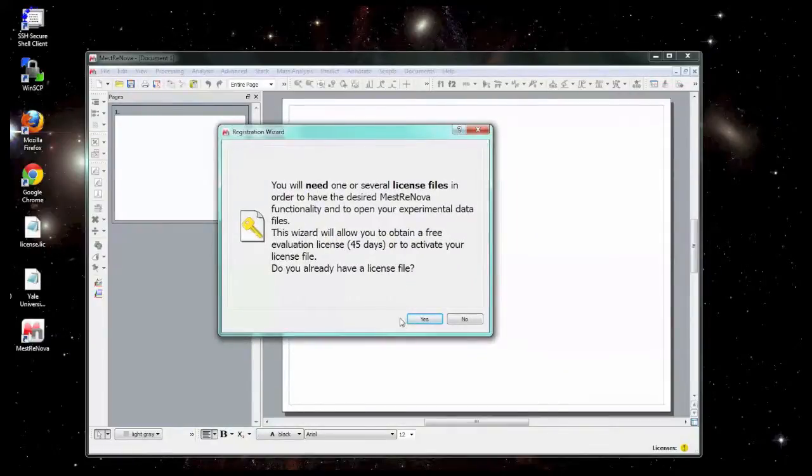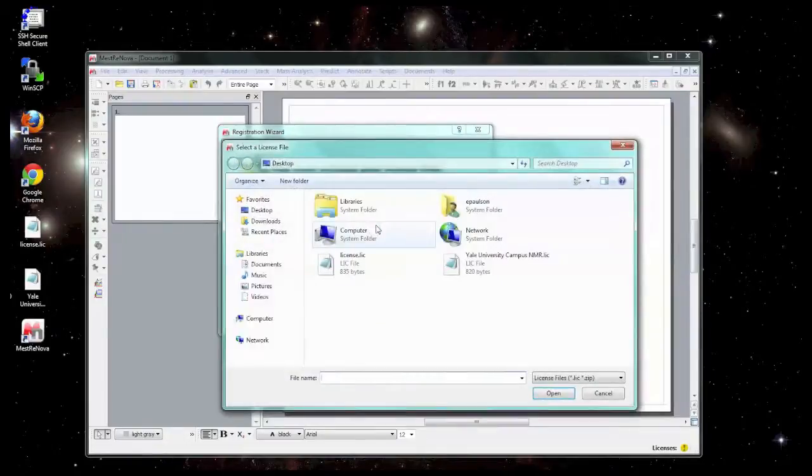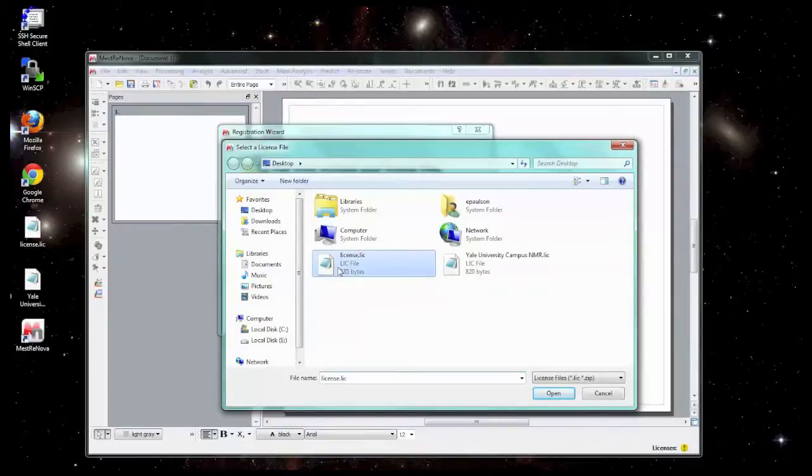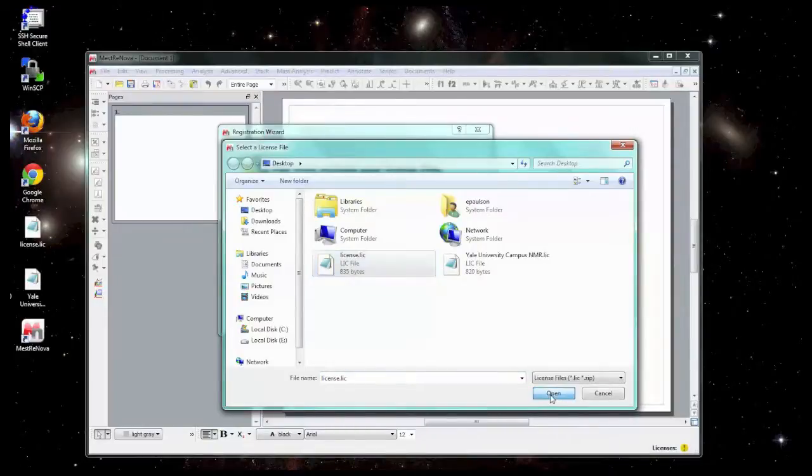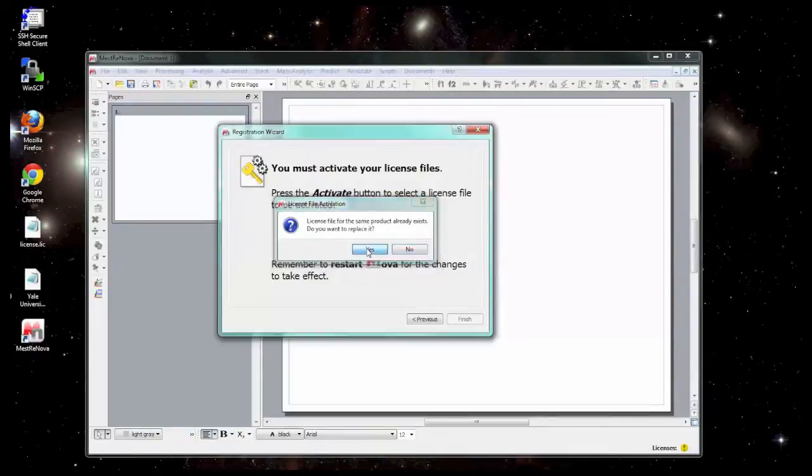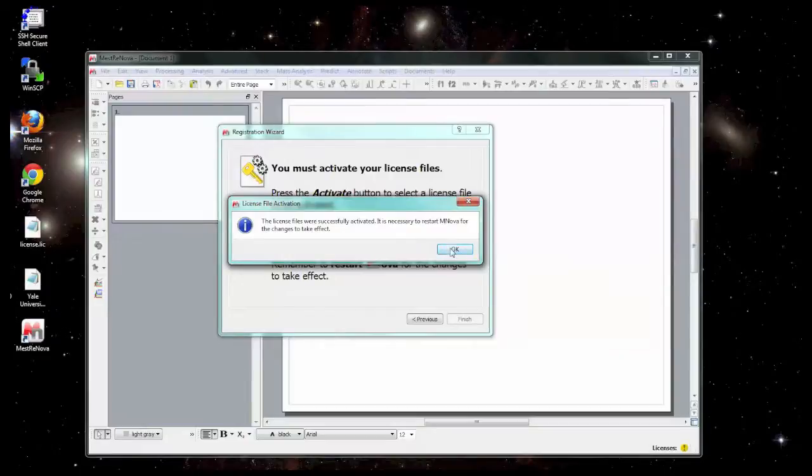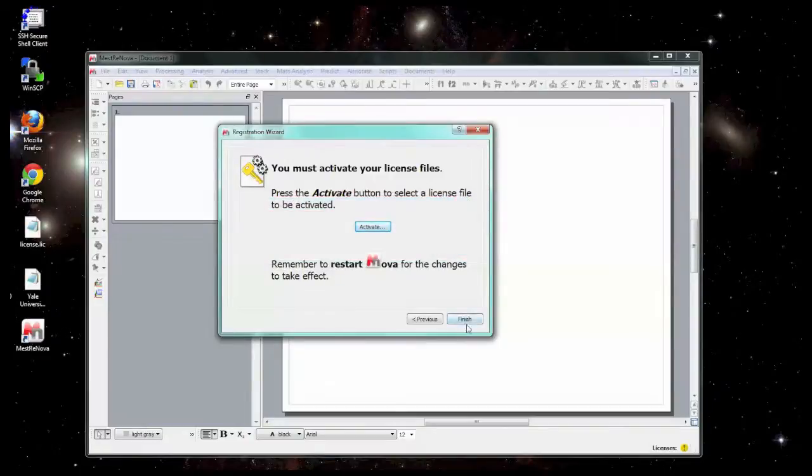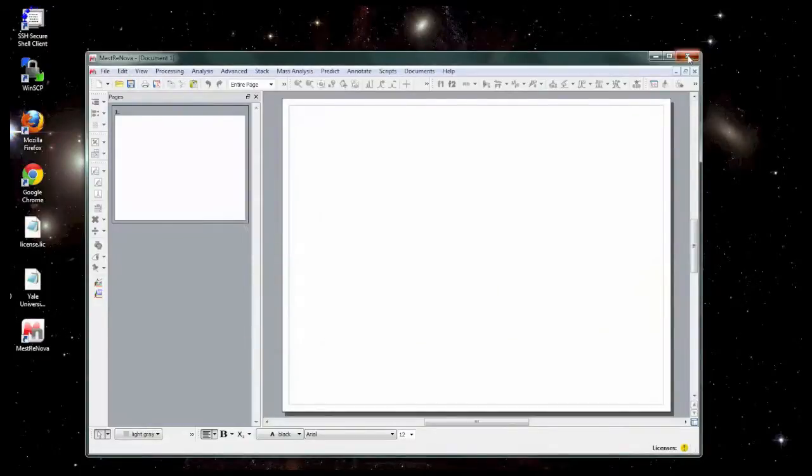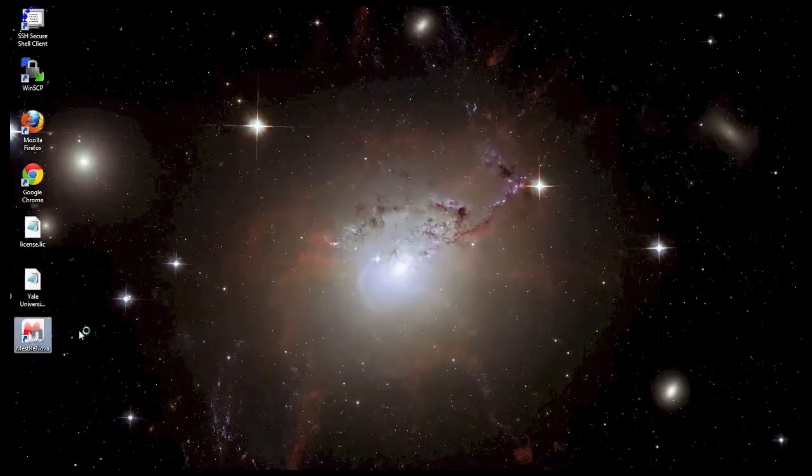We have a license file, so we're going to select yes. We're going to click activate. And now we're going to look for that license file that we saved. I'm going to select this one and click open. If it asks you this, go ahead and replace it. And it should say that the license file was successfully activated and you need to restart MNOVA. So we'll go ahead and select finish, close MNOVA, and restart it.